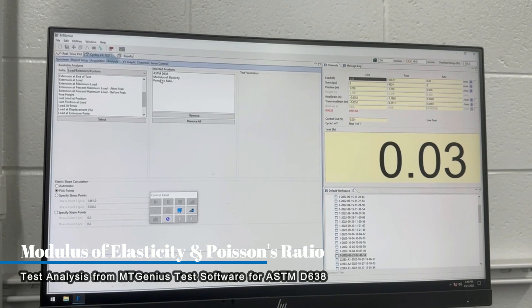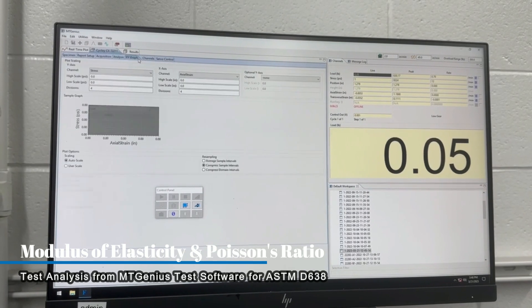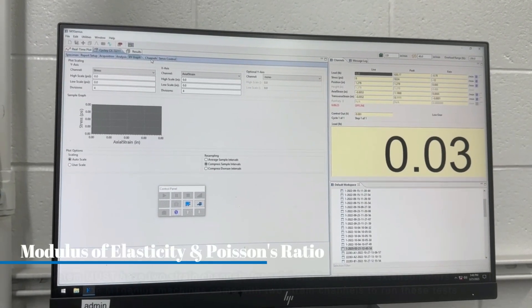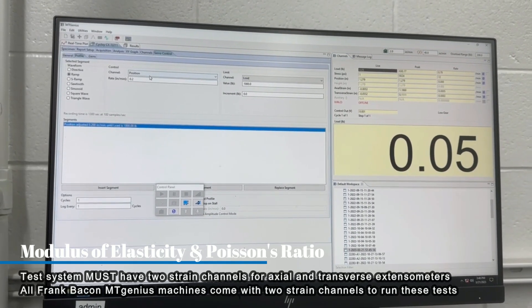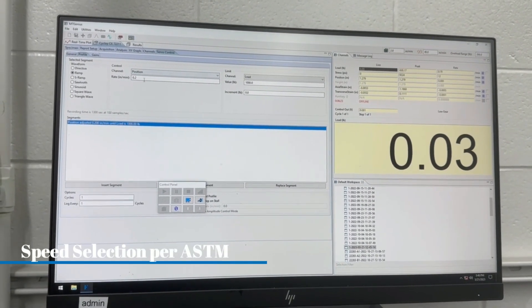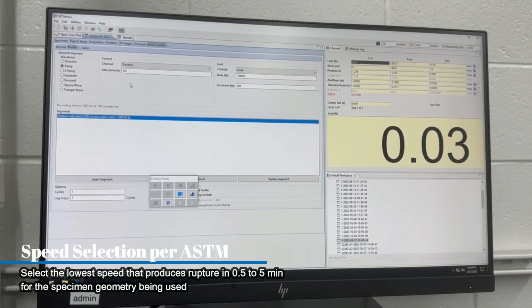This customer is also looking for modulus of elasticity and Poisson's ratio. We're going to do a stress-strain graph for the ASTM. This is our servo control at our rate of speed, which is determined by the specimen geometry in the ASTM.